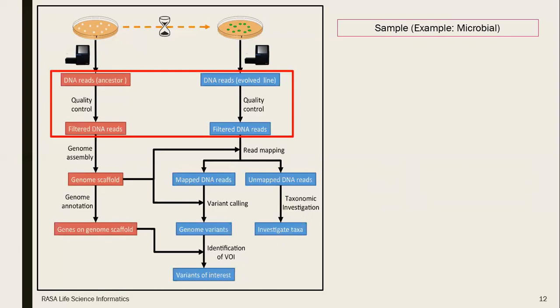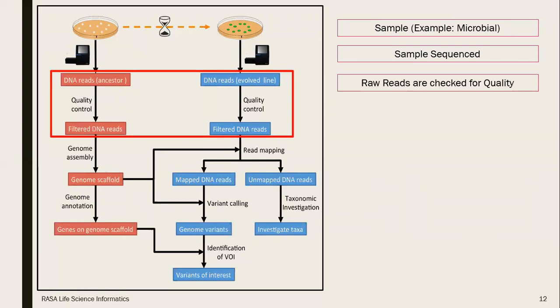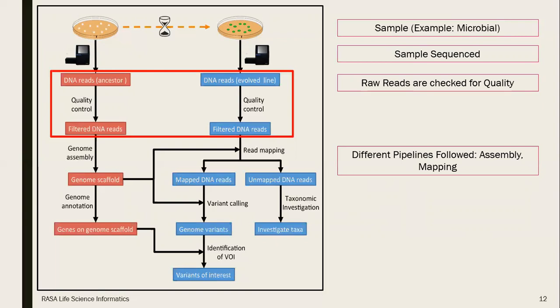The first thing we need to do is the sequencing data. The sequencing data is to assess the quality, whatever data is generated from the sequencing needs to be checked for the quality. That means we need to assess the quality of raw sequencing data. Then some pre-processing procedures have to be done to improve the initial quality of the data. The next step is mapping, also called aligning.